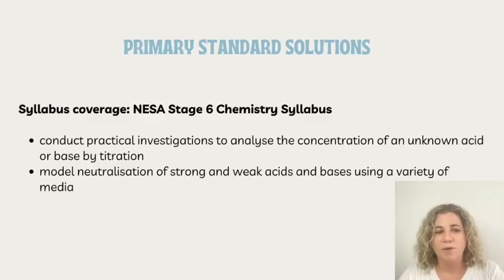So in this part of the course, we're going to look at covering these NESA Stage 6 chemistry syllabus outcomes. So we want to look at conducting practical investigations to analyze the concentration of an unknown acid or base by titration, and then also to model neutralization of strong and weak acids and bases using a variety of media. So let's get into it.